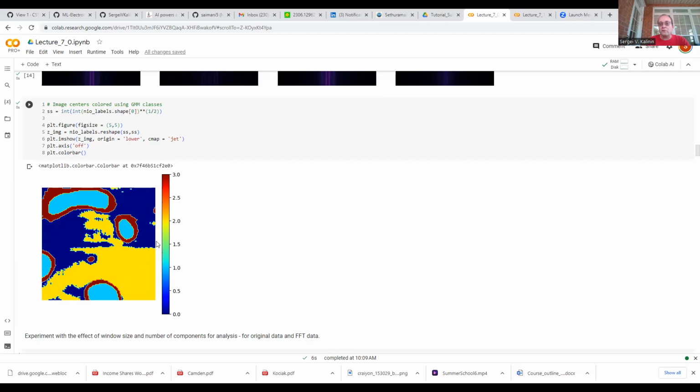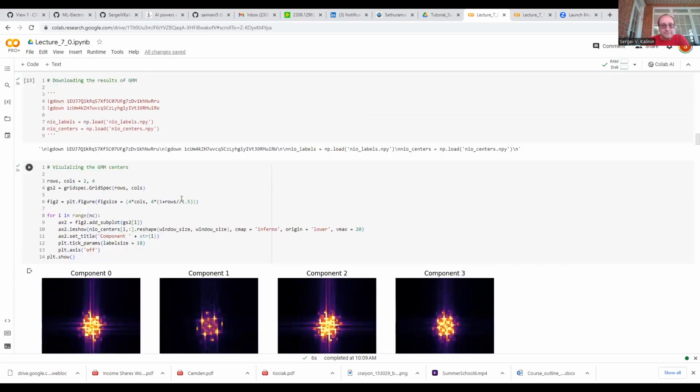It will find the true phase variability in the data, and it will find the variability associated with the way the microscope works. This type of behavior is in most cases associated with the non-ideality of the microscope performance.